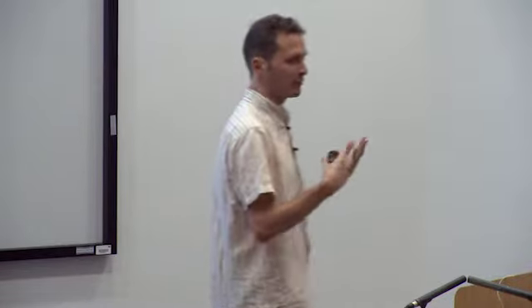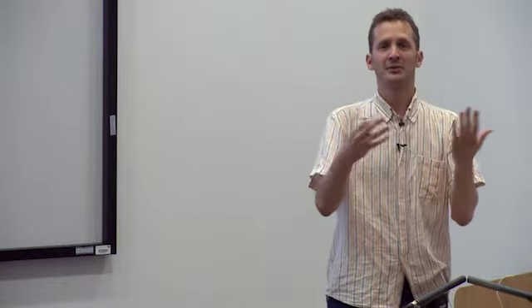Thank you, Chris. So the purpose of today's lecture is to give a little bit of insight into what goes on inside the computer programs when we actually align our images, either in 2D class averages or in 3D reconstruction. And this lecture is not really intended to give you practical insights on all the steps that you need to do in the workflow. That will be tomorrow's lecture by Rafa.